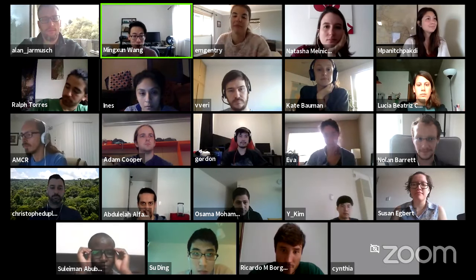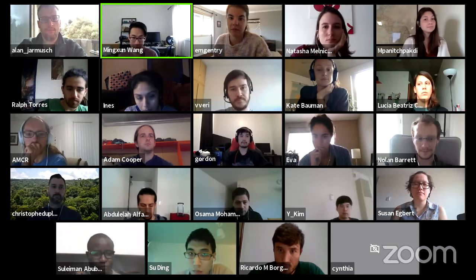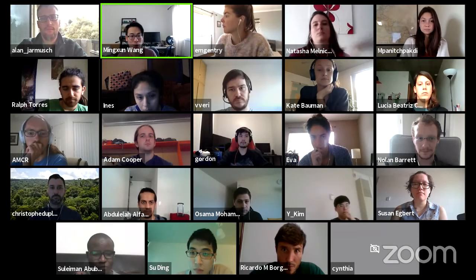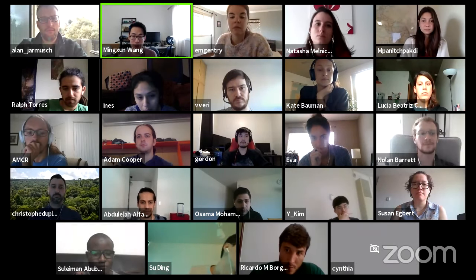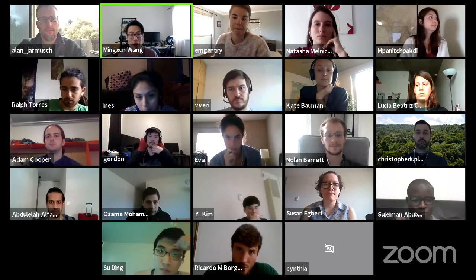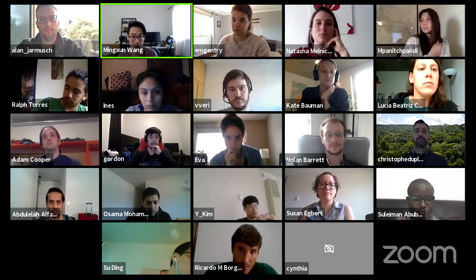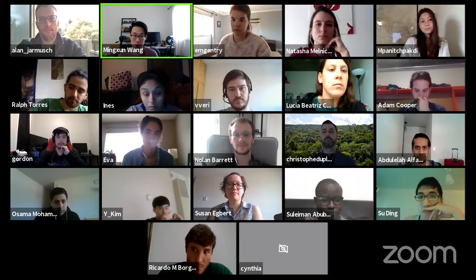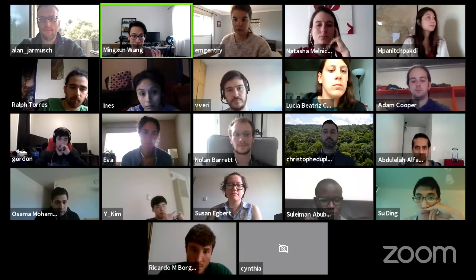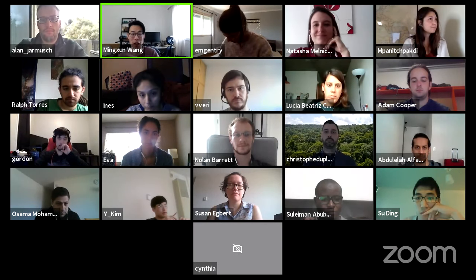So there'll be several portions of this particular hackathon workshop, and as an example, Osama asked how we can use this for dereplication. What we hope at the very end of this is not only that you learn how to make your own libraries of compounds that you know, but you can understand that it's useful almost immediately. So if you say that this tandem mass spectrum is this structure, you will be able to re-identify it in your own data, hopefully by the end of the day, at least by the end of the week. So that's kind of the goal, just trying to close the loop.